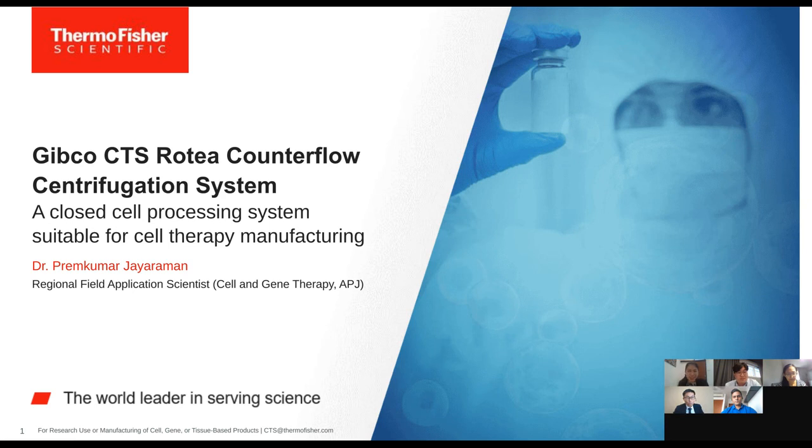All right, thank you, Do-young. And now moving on to a question by Yamamoto-san from the Osaka Uni. So Ogita-san, would you like to take this question? Okay, can you hear me? Okay, yes, we can. Thank you. I'm going to firstly translate the question in Japanese, in English. So the question is, what is the maximum number of cells that can be processed in one time, and how long would it take? So I'm going to firstly answer in Japanese.